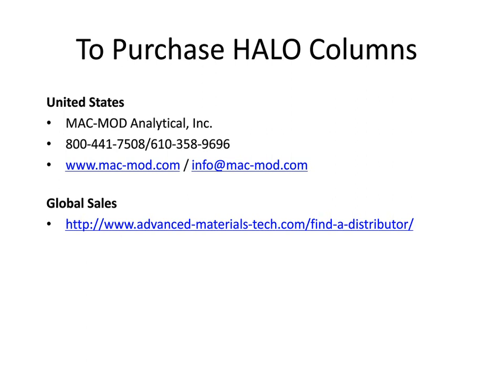Okay, well, let me tackle that by saying, whenever going to capillary columns, yes, you need to take considerable efforts in considering band dispersion, particularly on entrance to the mass spectrometer.